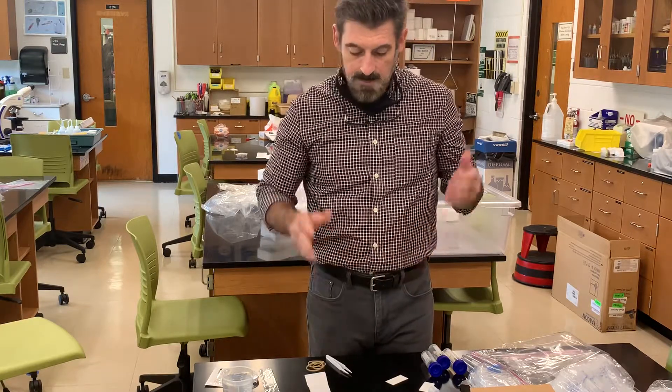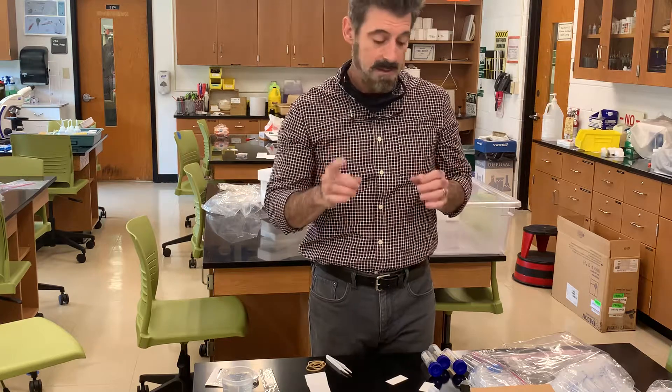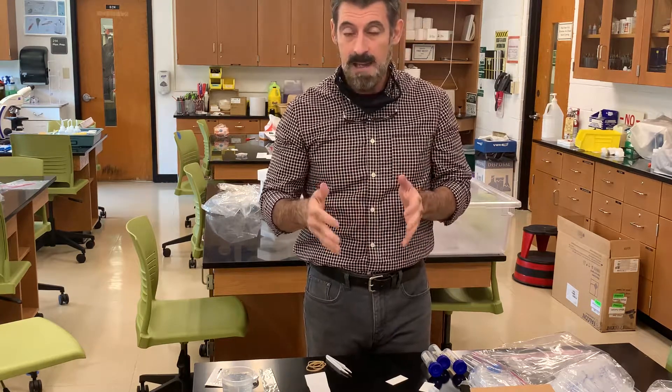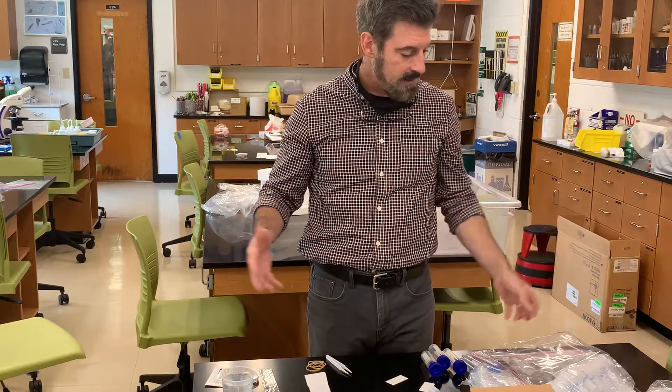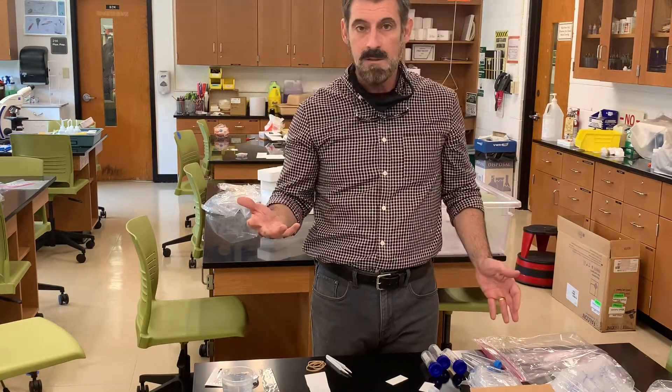That's pretty much it for the kit overview. Each individual lab will have its own explanation video. This was just to give you an idea of what's included in the kit.